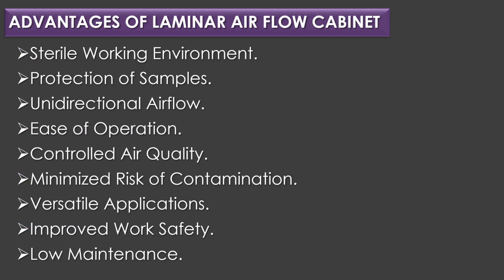Advantages of laminar airflow cabinet. The advantages of laminar airflow cabinet includes sterile working environment, protection of samples, unidirectional airflow, ease of operation, controlled air quality, minimized risk of contamination, versatile applications, improved work safety, and low maintenance.